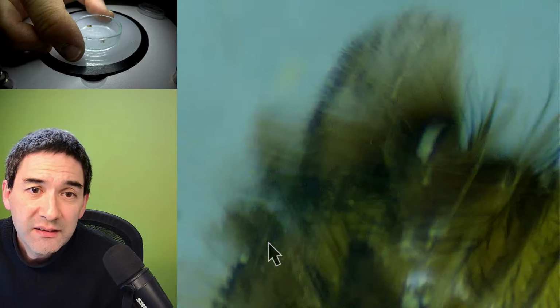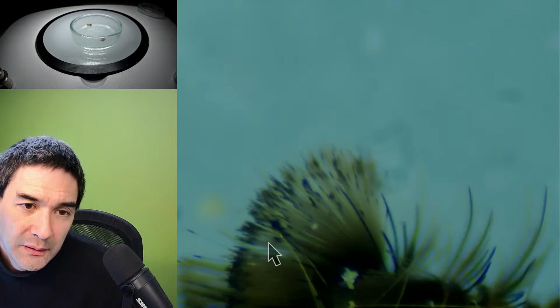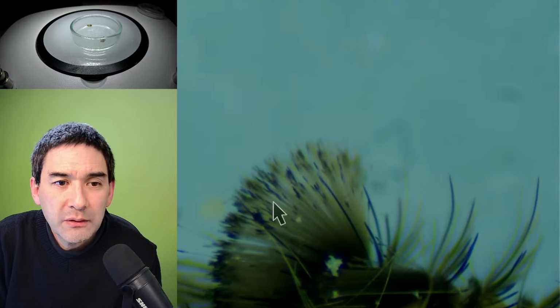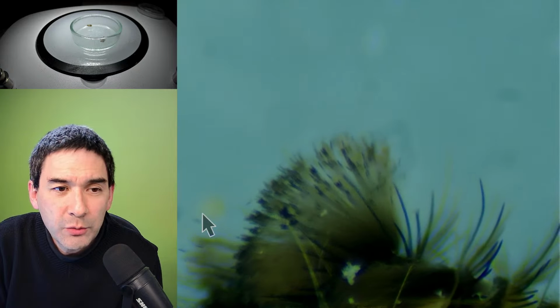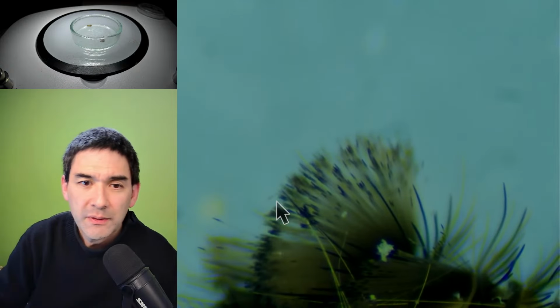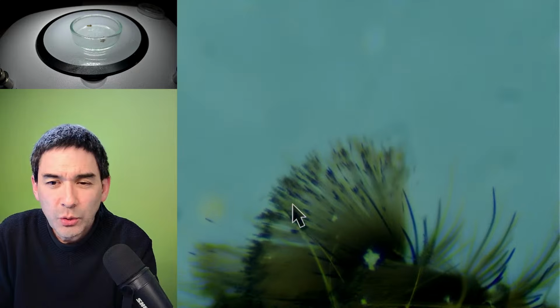Even here, you cannot quite see it as nicely. But those tiny little hairs, at the tips, they are a little bit larger. Over here, you can see that it's almost like an arrowhead that they have. So what I've done, I've actually found, I don't know if it's toxic or not.